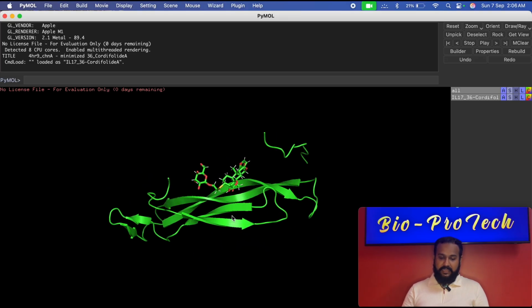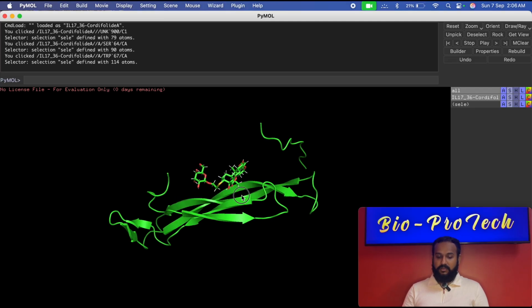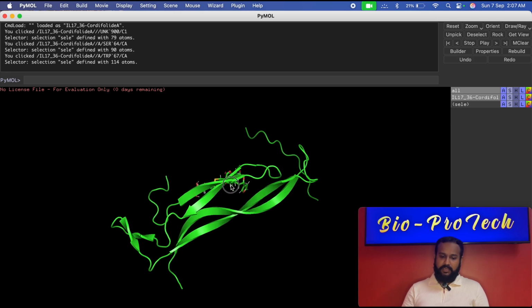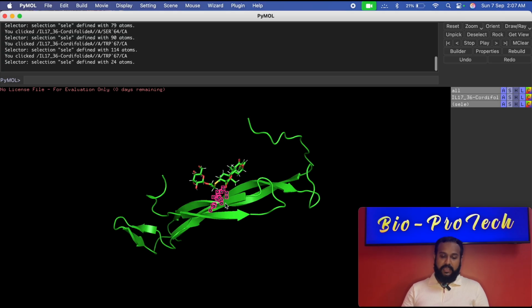This is your ligand molecule, and this is your protein molecule. As you can see clearly, it only has beta sheets; alpha helices are not over here. This is done using Glide. Glide is a paid tool from Schrodinger. Apart from that, you can also do this kind of docking using DiffDock and SwissDock, and likewise AutoDock Vina, AutoDock 4, PyRx, for your automation.